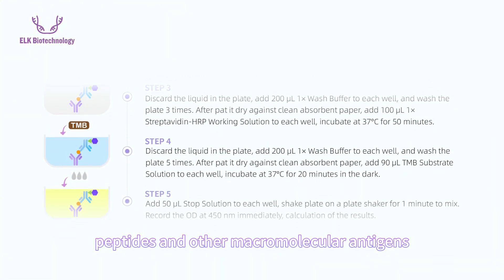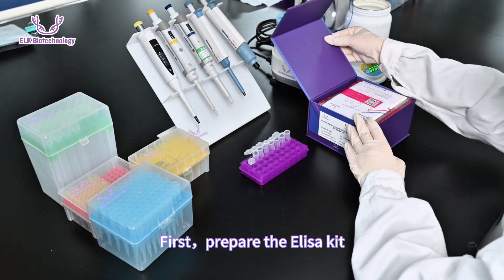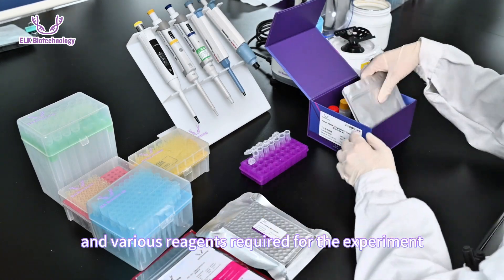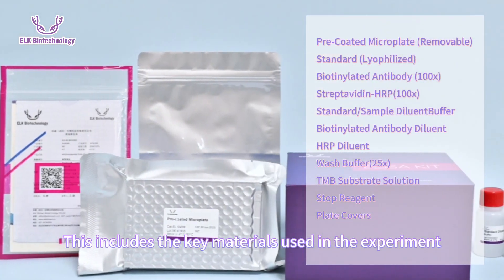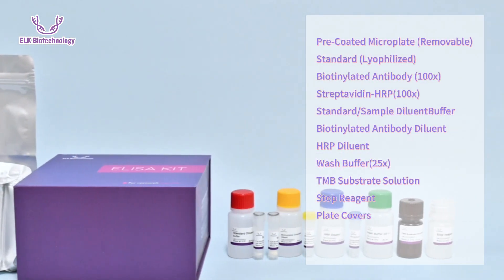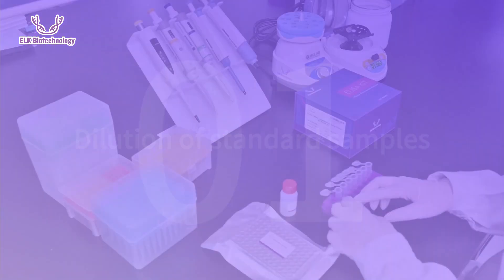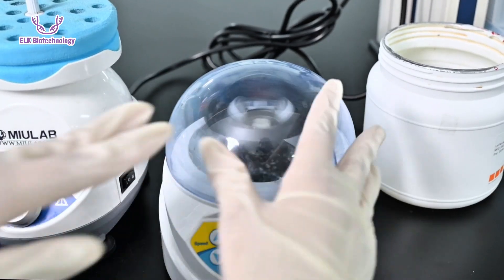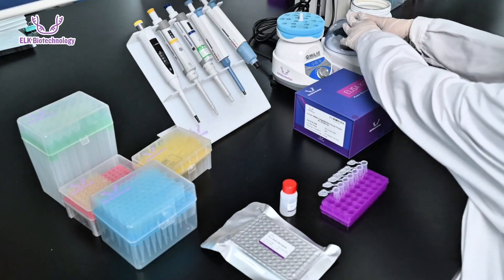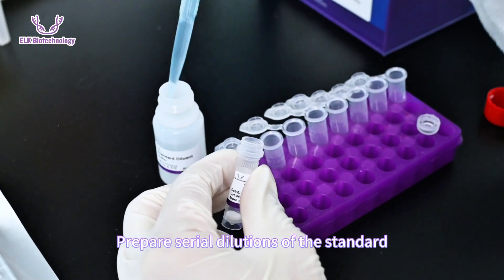First, prepare the ELISA kit and various reagents required for the experiment, including the key materials used. Next, prepare standard samples and test samples, then prepare serial dilutions of the standard.